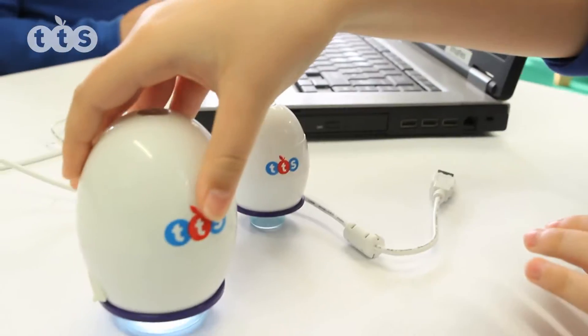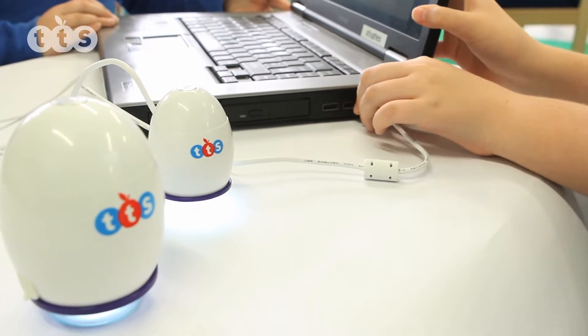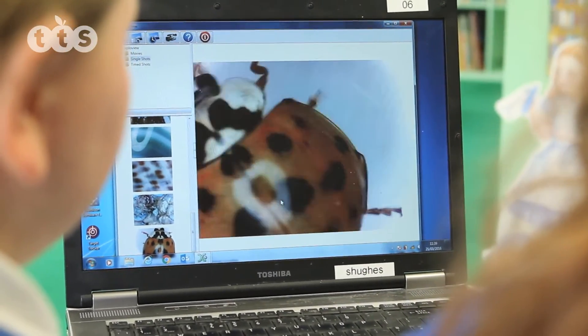The EasyScope and EasyScope Digital Microscopes are egg-shaped devices that neatly fit into the palm of the hand. They produce an image that can be clearly seen on the computer screen by a child or by a group of children for discussion.